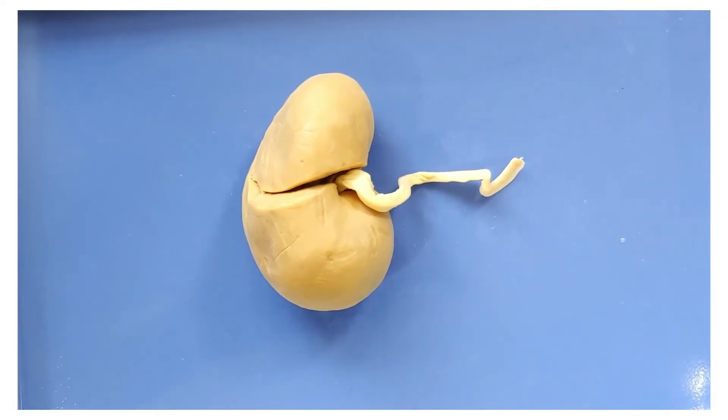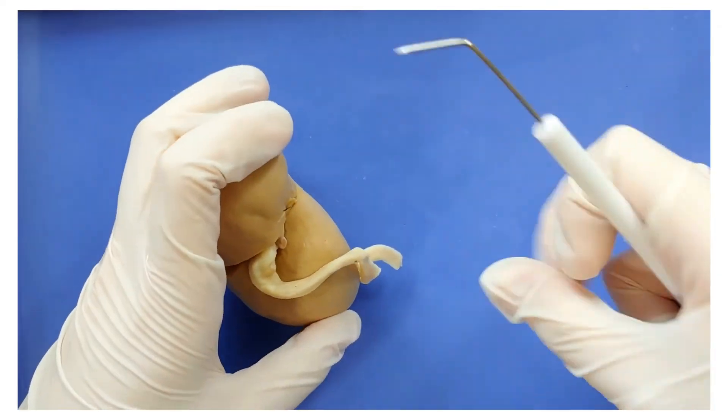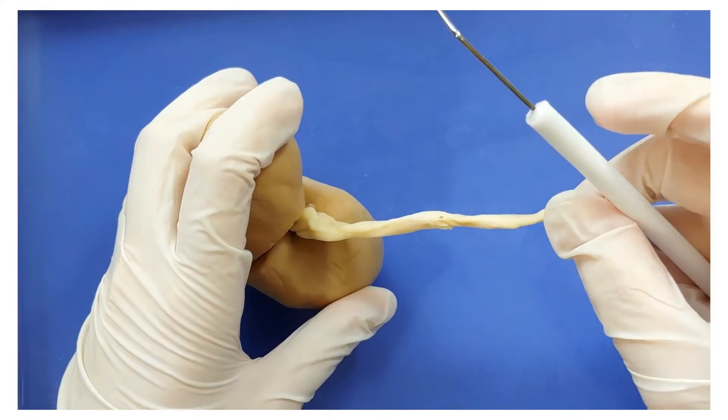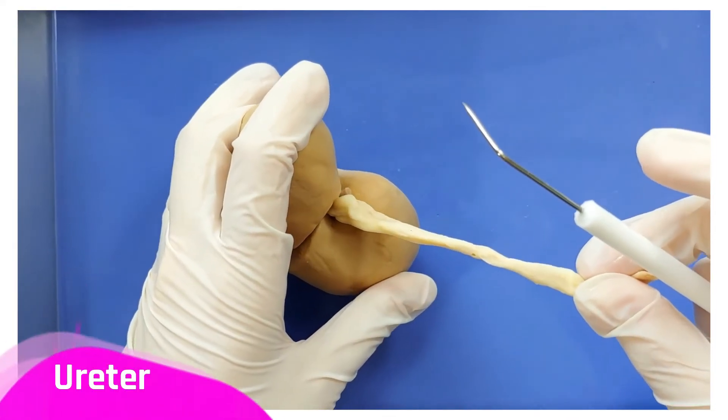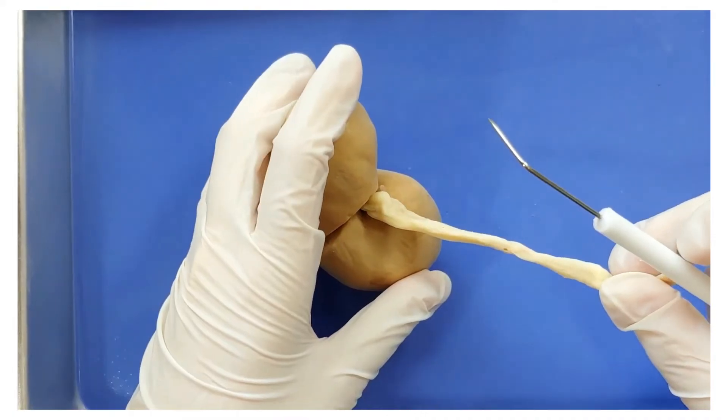So let's take a look at some of the structures. You'll see three pipe-like things attached here. The one that is most covered in fat — so this one — will be the ureter, which is the long tube that takes the urine from the kidney to the bladder.